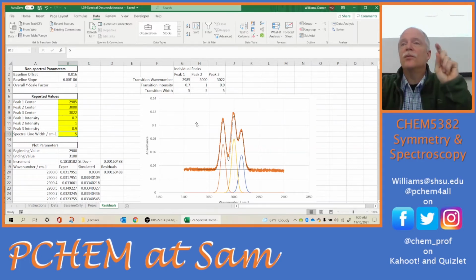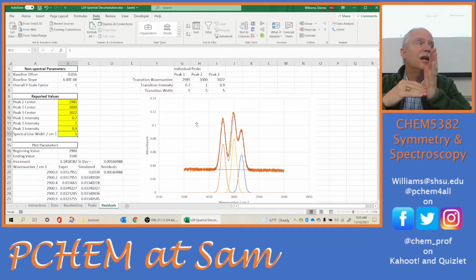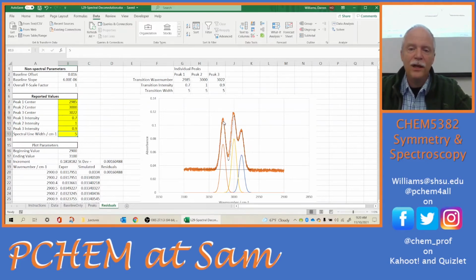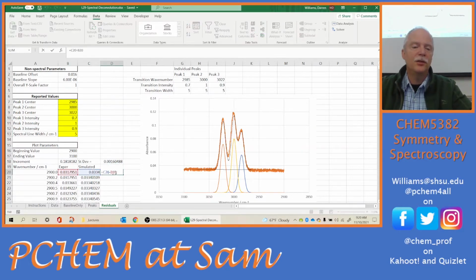So this is a principle that you need to think about and maybe even write some things down on. How do you compare two data sets? We have a simulated data set and an experimental data set. How do we compare them? What are you doing with your eye? Looking for differences. Yeah. So with your eye, you're looking for differences. You're looking at these gaps here. Well, we can do that mathematically. We can take residuals. So the residuals are just differences between experiment and simulation.